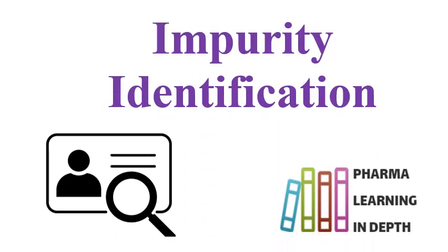Impurity identification is the topic for the present video, and in this video we are going to see when impurity identification is required, why identification of impurity is critical, how it is done, and what are the possible ways to identify the impurity.